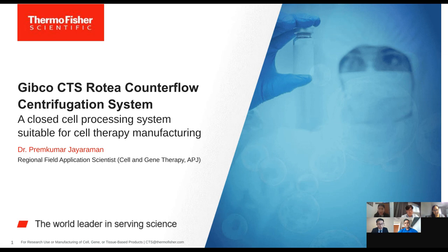So I'd like to hand it over to Jacqueline-san. Okay, thank you, Noble. So we have another question from Mochida-san from Takeda, asking, so Noble, you could answer this as well. Have you used inline filter in cluster wash concentrate experiments? I see. Inline filter.